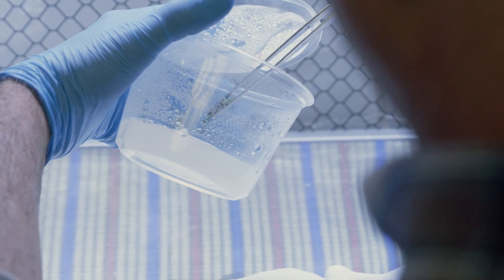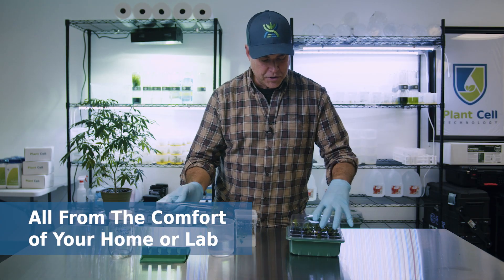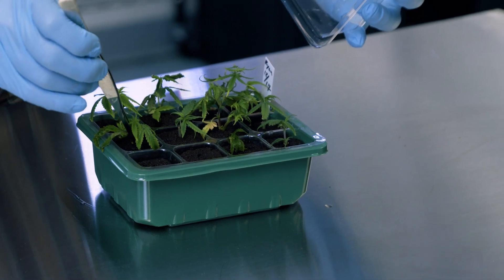But this has everything it needs now to grow our new plants. Give it a little rinse to make sure that sugar solution is off. Into the plug we go.